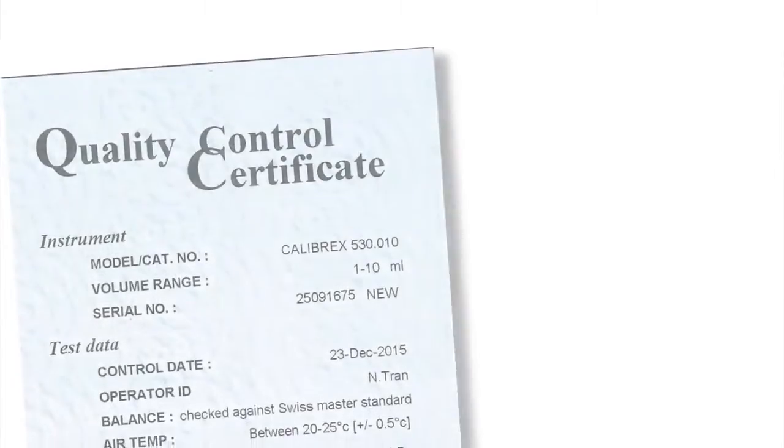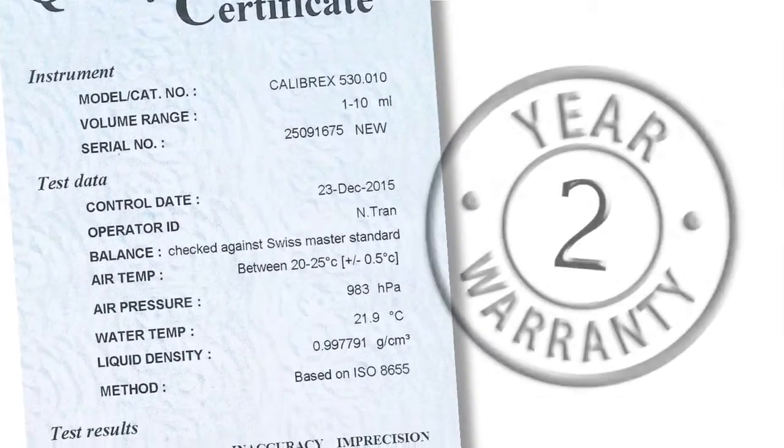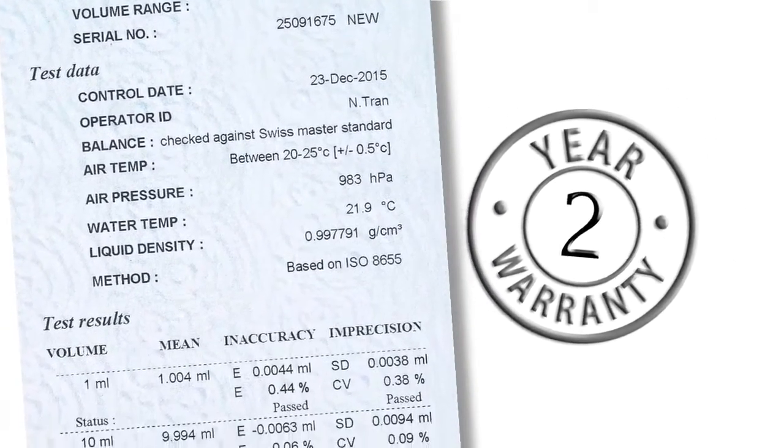Each Calibrex dispenser comes with an individual QC certificate and an exclusive 2-year factory warranty.